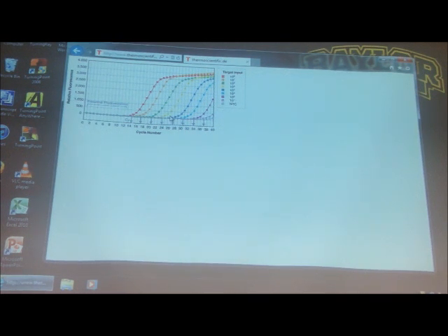So how do you know exactly? In the old days when they were doing PCR and tried to do it quantitatively, they would have to stop it at every cycle and then run it on a gel and figure out where it's going to happen, because the cycle at which you stop it determines how much you're going to see, and whether you're going to see a difference between one amount and another. And mind you, these amounts are orders of magnitude different, right? Each one is tenfold different. So using PCR to estimate the concentration of mRNA was a very dicey proposition.